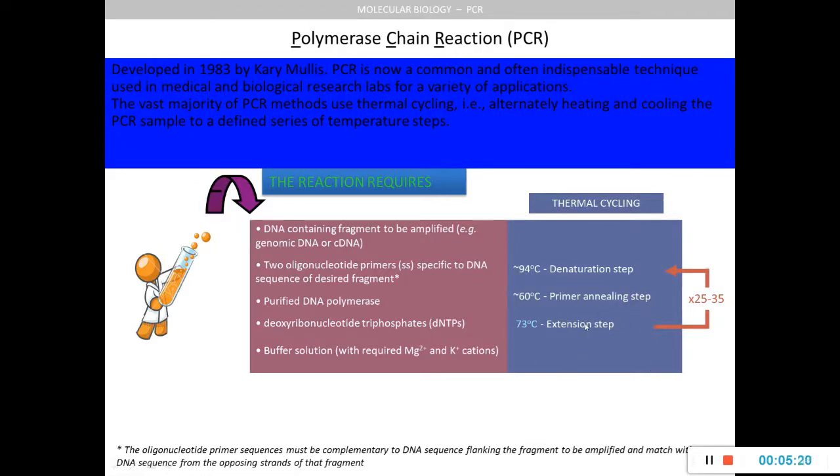So it's a chain reaction, that is denaturation, primer annealing step, and extension. Like that, the three steps are being followed one after the other to result in the formation of a huge amount of DNA of a small gene, not the entire DNA sequence, but a small bit of the DNA which helps us to identify the presence of the pathogen is being multiplied. PCR in fact is named as a photocopying machine of DNA.